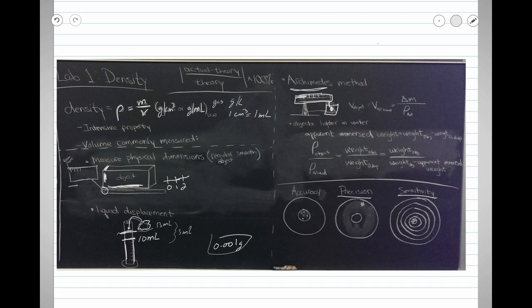The objects that we're going to give you are either going to be rectangular prisms like this, or cylinders, which is vaguely this shape, but I didn't come here for my art skills. I'm sorry, you guys. It's not at all what a cylinder looks like. There we go. That's vaguely cylindry.